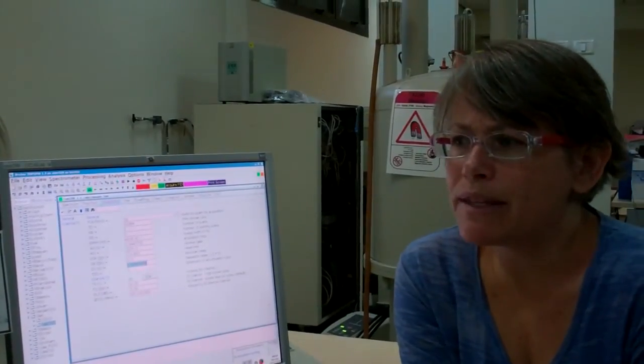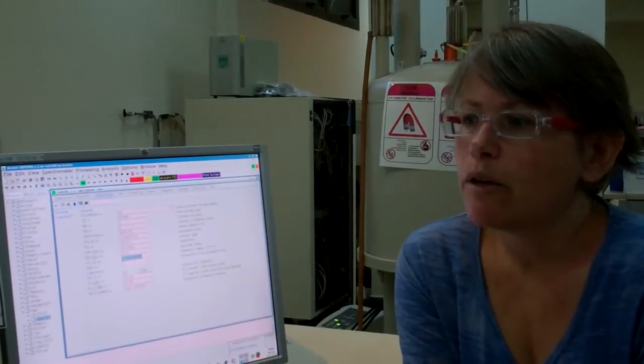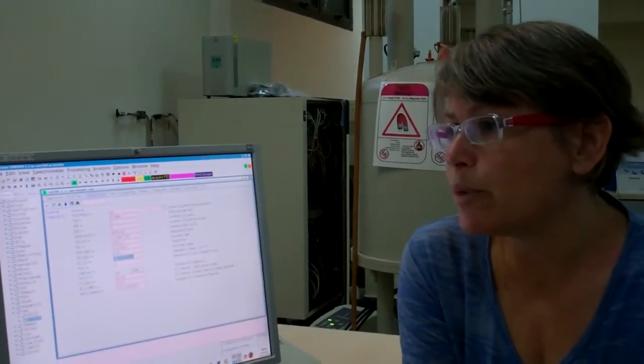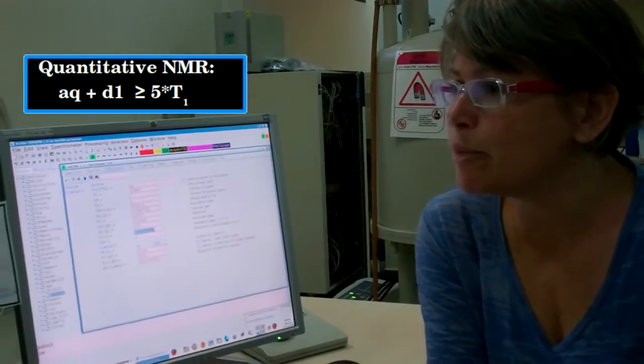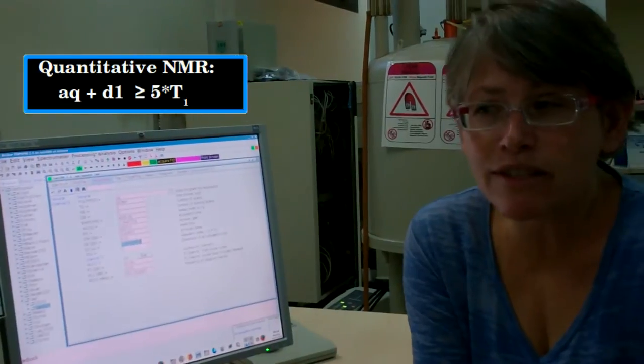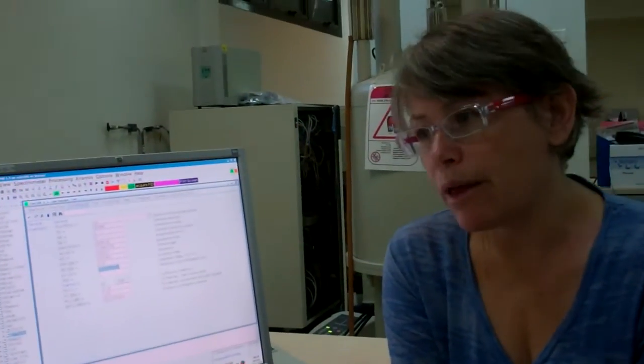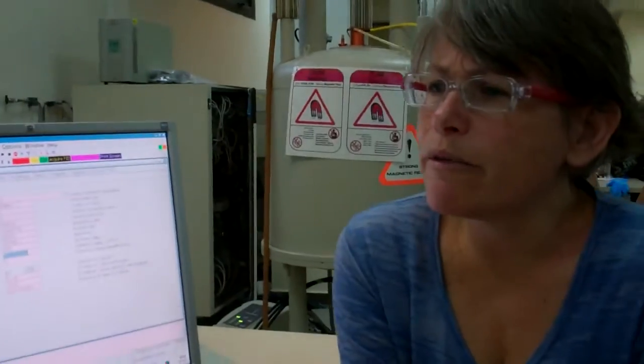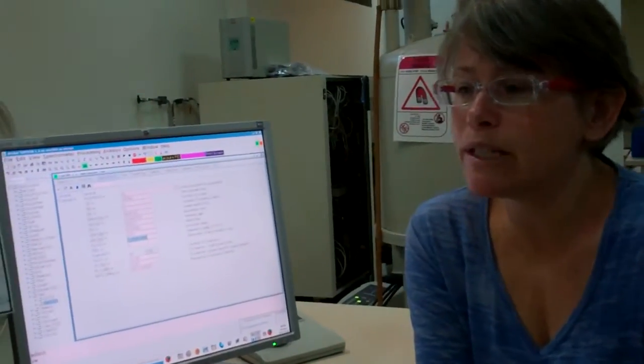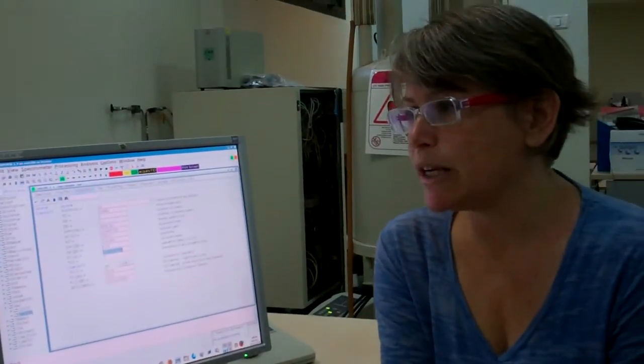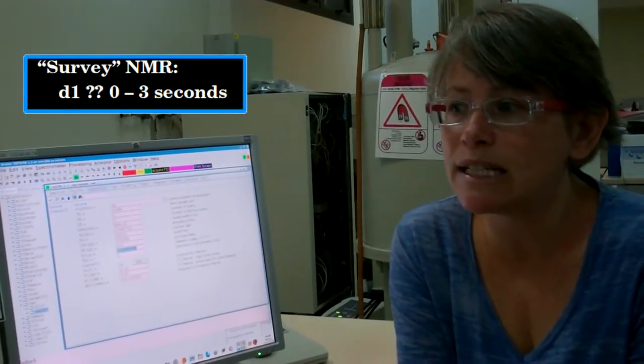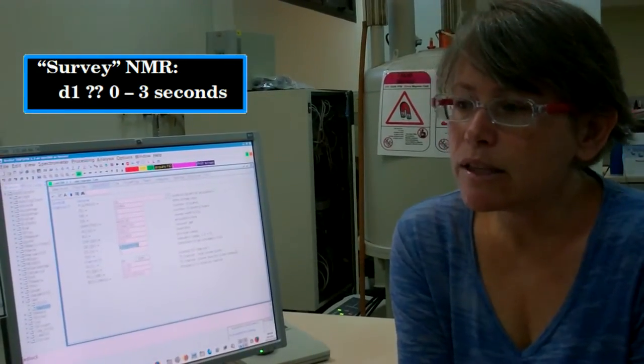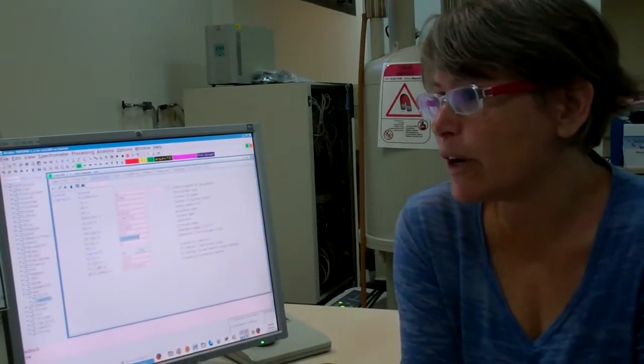In short, I don't know the T1 of this sample at this field without measuring it. For quantitative measurements, it is important to measure the longest T1 value of the signals of interest and to set AQ plus D1 greater than or equal to 5 times T1. On the other hand, if you would like to suppress a peak using RF saturation, you should be pulsing faster than about one-half of T1. For standard or survey proton NMR, a typical range of values are between 0 to 3 seconds when the FID is not being truncated. So this default value of 2.5 seconds is fine for now.